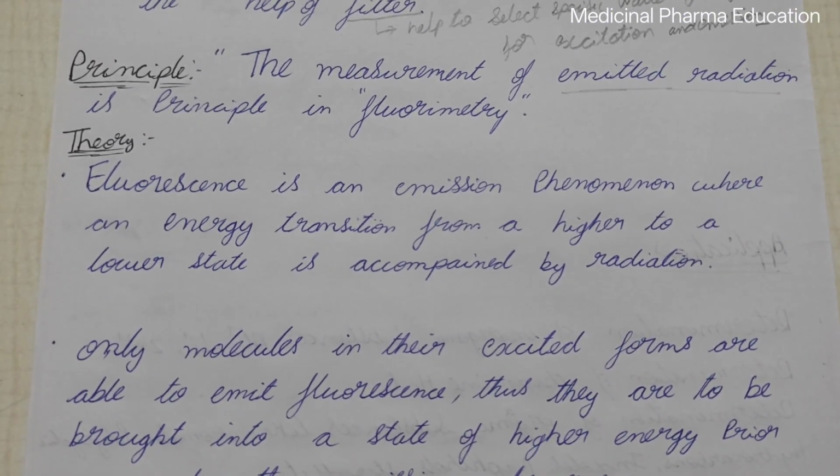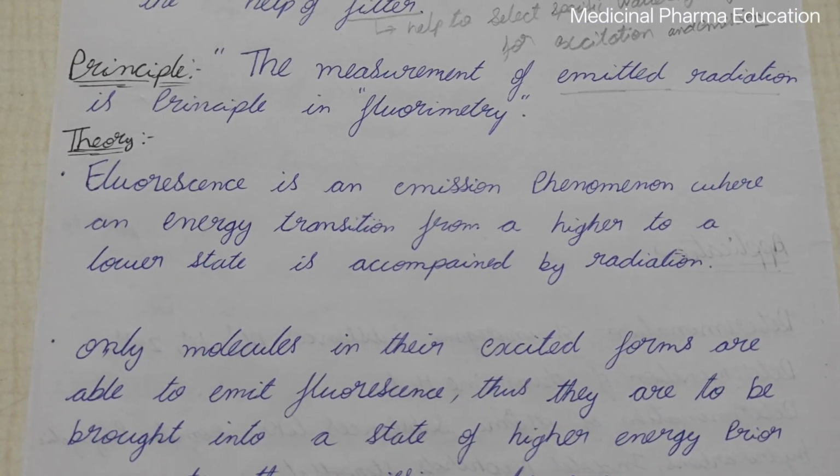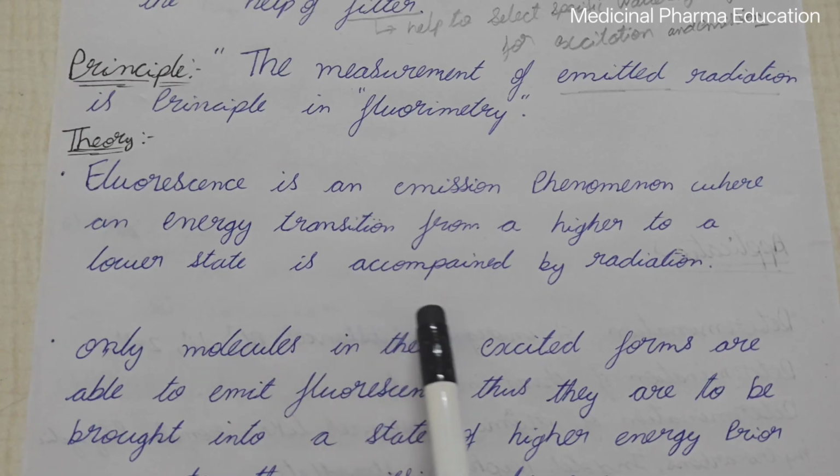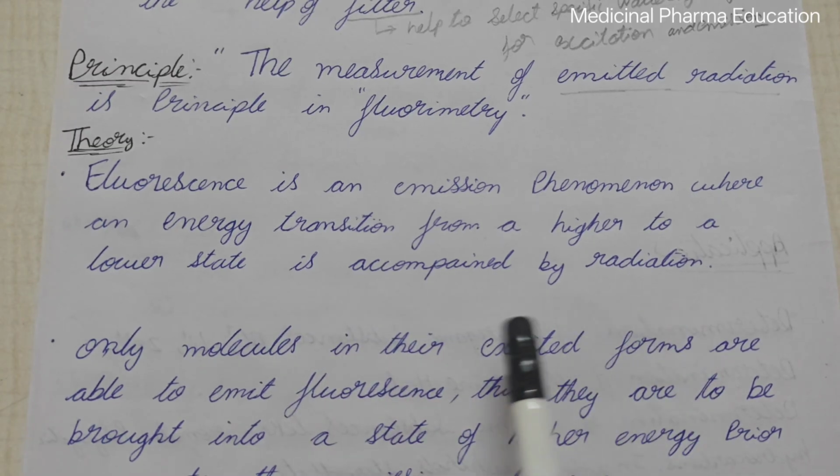Next, fluorescence. Fluorescence is an emission phenomenon where the energy transition from a higher to a lower state is accompanied by radiation.